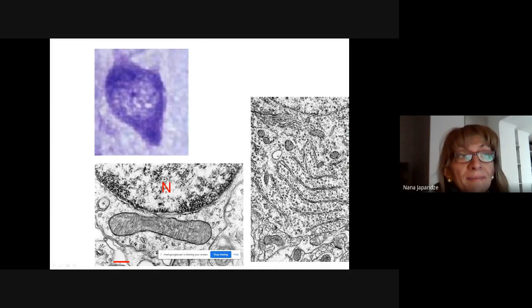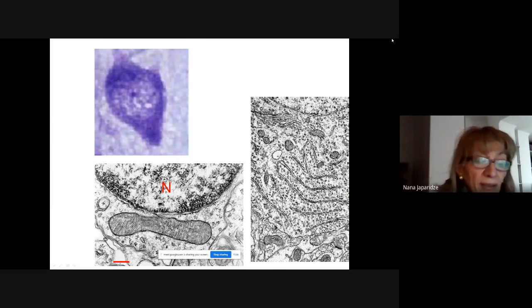and you see the Golgi complex and rough endoplasmic reticulum. Look, this is rough endoplasmic reticulum with a set of membranes. Look, a set of membranes, and also the polysomes are identifiable between the set of membranes and on the surfaces of these membranes. Profiles of mitochondria are also clearly visible here.